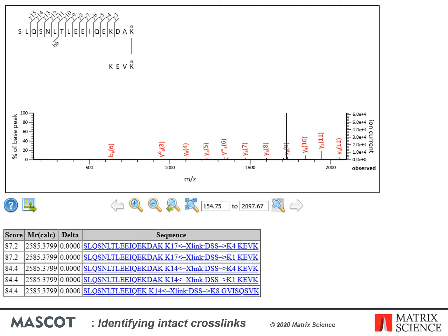Here's a cross-linked match where the identity of the beta peptide should be questioned. The alpha peptide has a nice sequence ladder, but there's no fragmentation from the beta. There's an almost as good a match at rank 5, where the beta peptide is completely different. The alternatives score almost the same, because there are no alpha fragments that span the linker site. The two alpha fragments match exactly the same observed fragments.